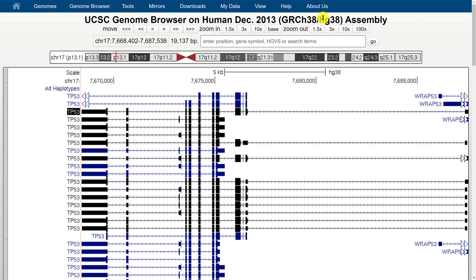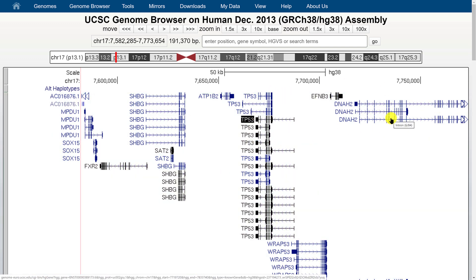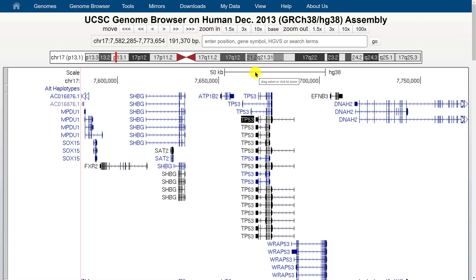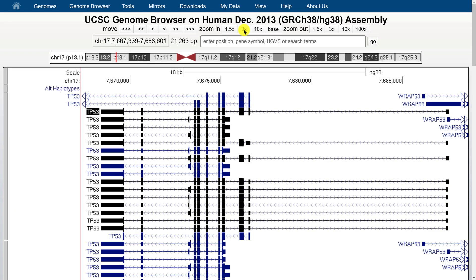There's a series of navigation buttons at the top that are always present on every browser window — you can zoom in and zoom out. The zooming is centered on whatever the center of your current window is. For example, centered on the p53 gene annotation, if we zoom out 10x the browser is still centered on p53 but we're now ten times further out and can see all the genes in the neighborhood.